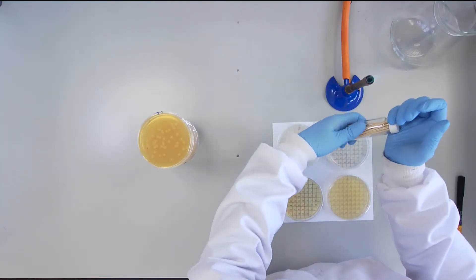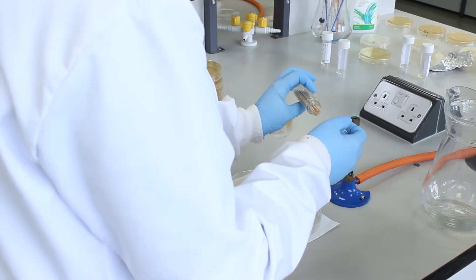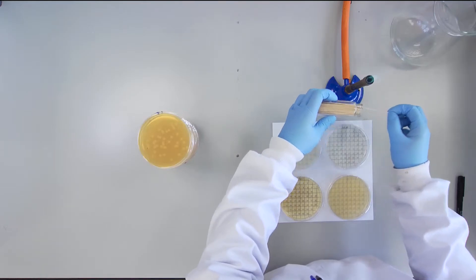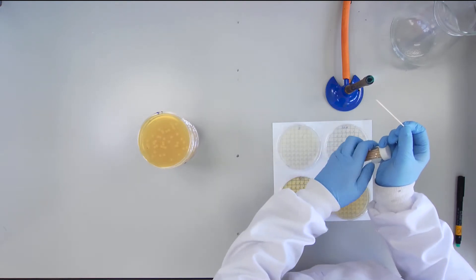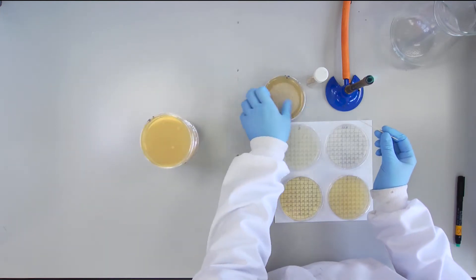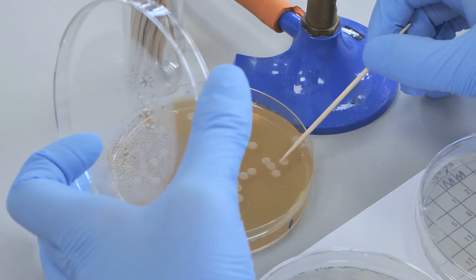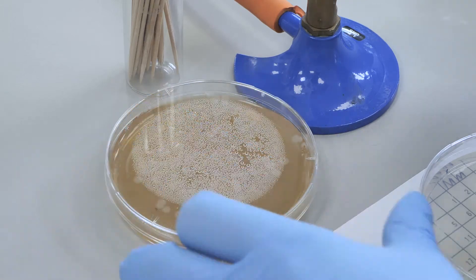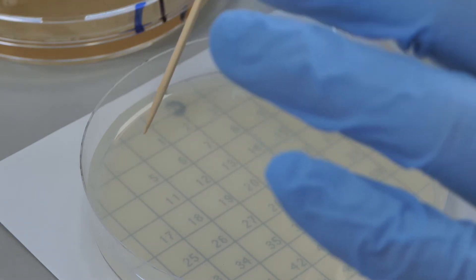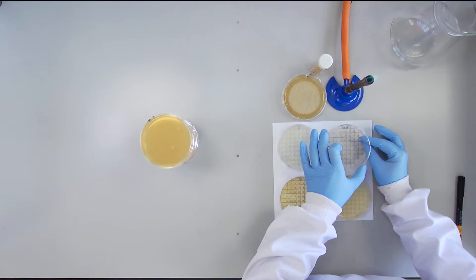Aseptically remove a cocktail stick from the glass universal. This can be a little tricky but take your time and work close to the flame. Now touch the cocktail stick off one of the colonies to be screened. Be very careful not to take any of the agar medium in a transfer, just the colony. Now touch the cocktail stick against the agar at the same numbered position on each of the four plates.